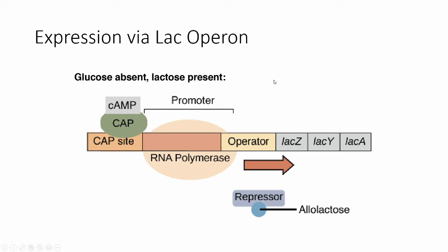What this lac operon is supposed to do in nature is break down lactose, a disaccharide, into its monosaccharides, glucose and galactose, by transcribing and translating the LacZ gene into beta-gal. Don't get this confused with the beta-gal we're trying to make. This is just the beta-gal that is naturally made from the lac operon.